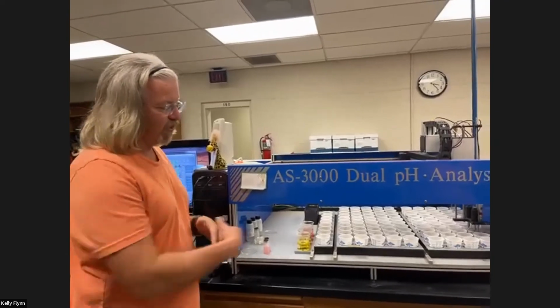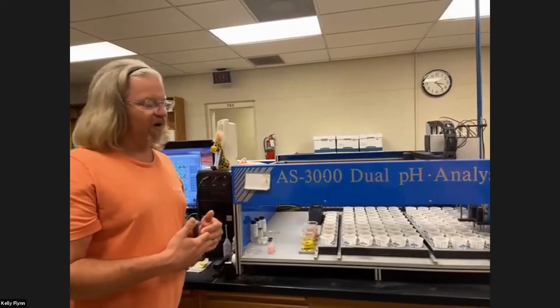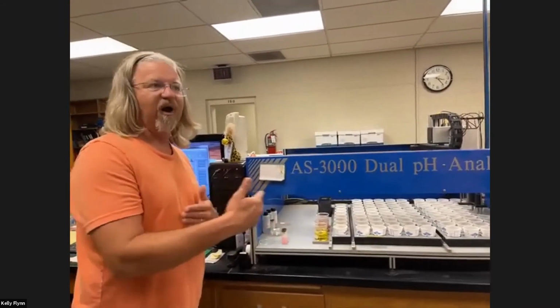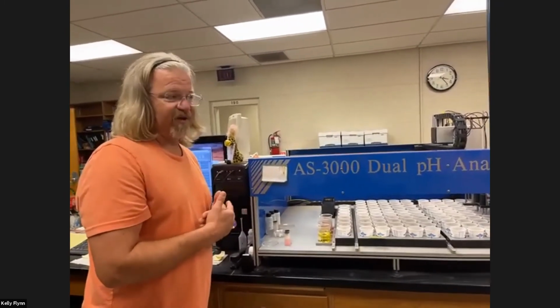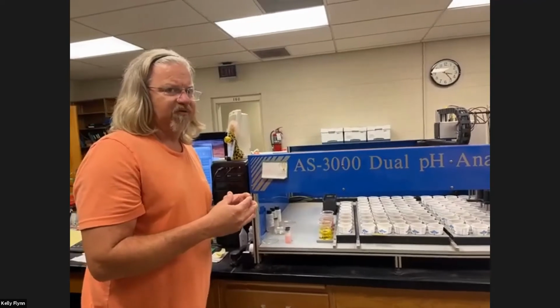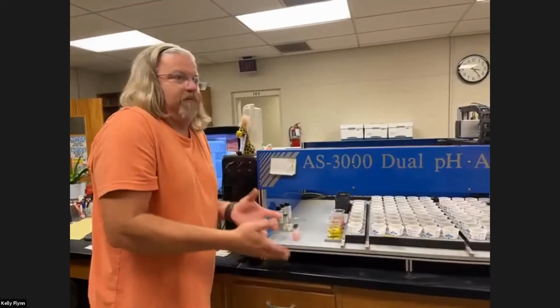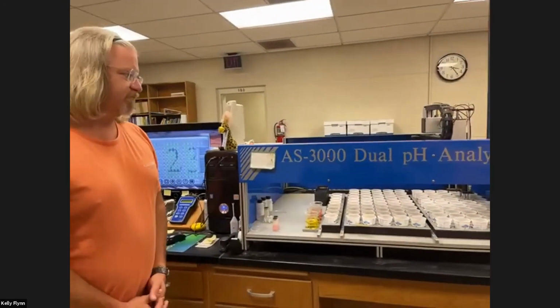It's very easy for me to tell throughout the run, if I'm watching the numbers, what's managed soil and what's not. So bunches of low numbers, I can tell, oh, no one's doing anything with this. But when I encounter a large batch from farmers, you can tell that they're all generally somewhat managed. They're between the 6 and the 7s. We've even encountered samples where someone has limed right away, and you can actually see particles of lime in their soil. And it's like, oh my gosh, because it's bouncing around, or it's 8 or 9. Well, that's because there's lime right there dissolving on the spot. So pH is a very interesting area of the lab for sure.